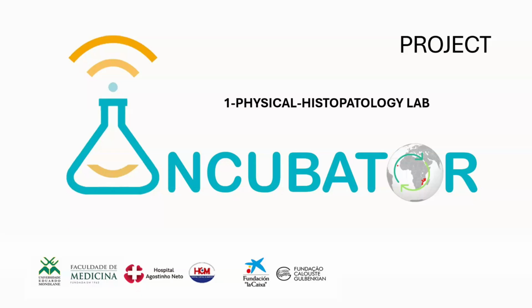of patients. And we created a virtual laboratory to increase access to biomedical imaging, and to address the shortage of well-equipped microscope labs and unequal access.